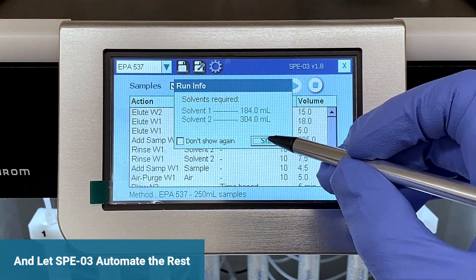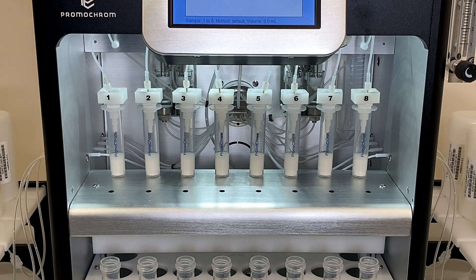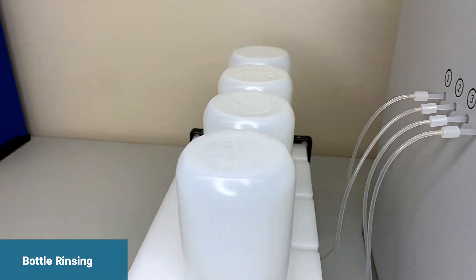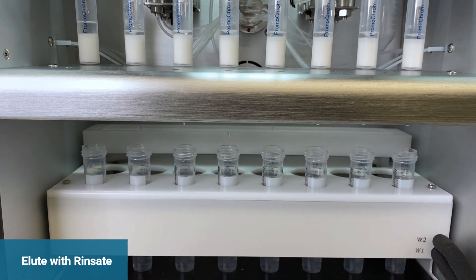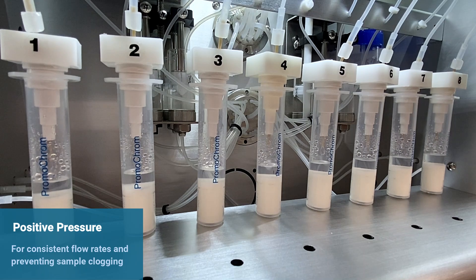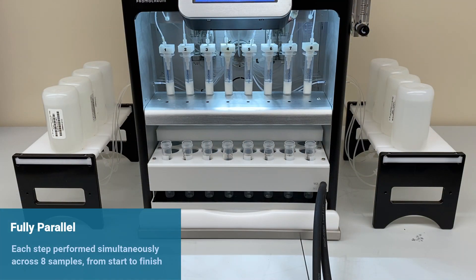You are now ready to push start and walk away. The system will fully automate all the extraction steps, including cartridge preconditioning, sample loading, bottle rinsing, nitrogen drying, and final rinsing and dilution. Positive pressure is utilized at all times to ensure consistent flow rates and prevent sample clogging. Every single step is done in parallel across all eight samples, making the extraction highly efficient and ensuring that samples start and finish at the same time.